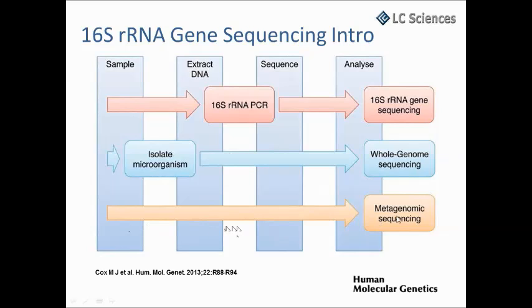And then there came another approach, metagenomic sequencing, where they don't isolate the colony or separate the bacteria anymore. They just sequence the whole DNA extracted from the bacterial mixture, or from the soil, from the water, something, and then sequence all the fragments from the multiple microorganisms. And after that, assign the reads based on the alignment to know what species, what's the taxonomy inside that mixture.